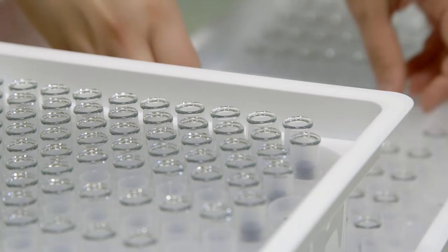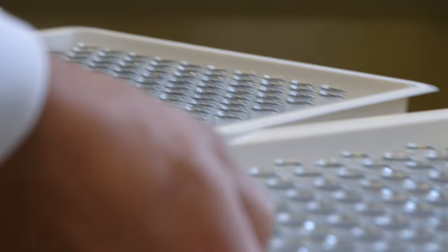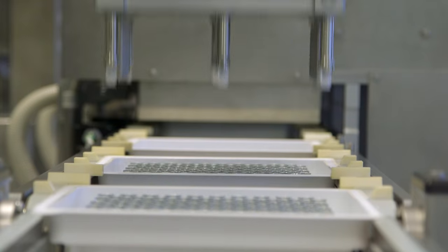In the second stage, we harvest the allantoic fluid from the eggs. This allantoic fluid contains millions and millions of copies of influenza virus.